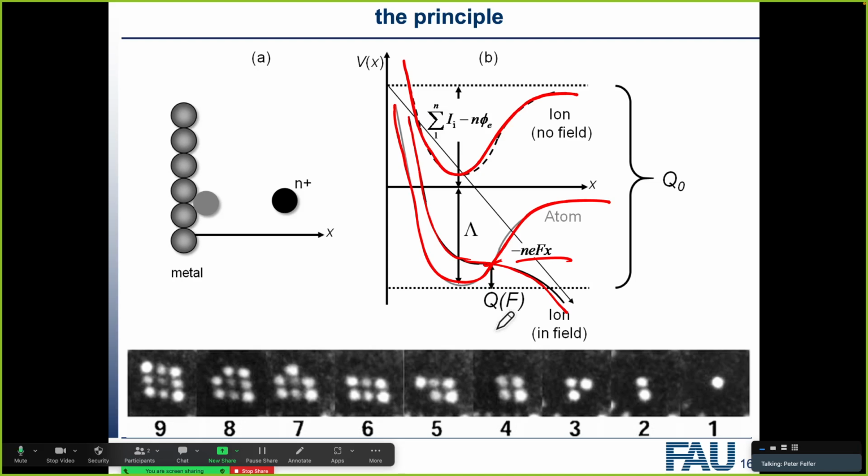unfortunately it's been very successful as a theory, even though we know that from a quantum mechanical standpoint there are a lot of things here that can't quite be true. But only now, in the last 2 or 3 years, people have really been able to do quantum mechanics calculations. And maybe I'll pester the guys at Max Planck in Düsseldorf who have been doing these calculations to give me some nice movies. So now we're able to atomistically simulate these things as well. But the simple model is you have an atom that sits on a surface and it moves away from the surface. And that is a very controlled process.